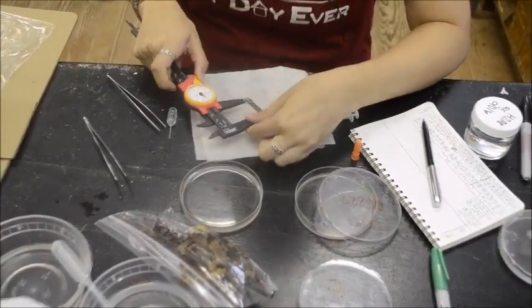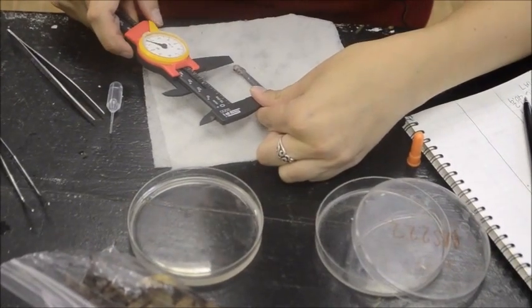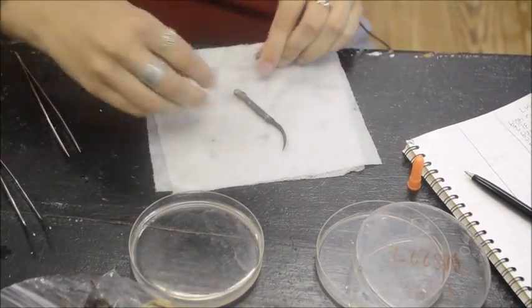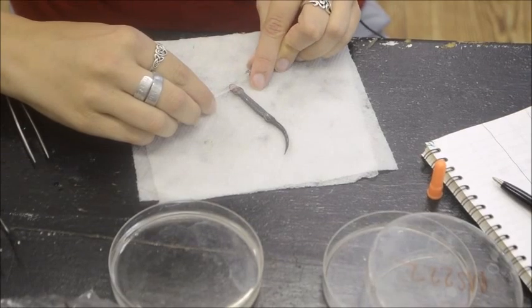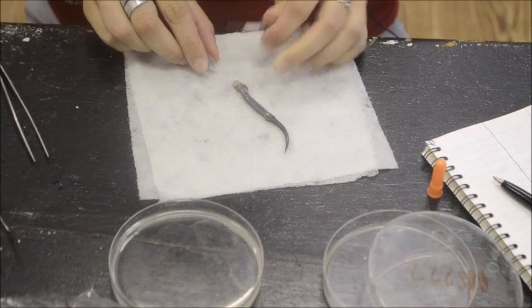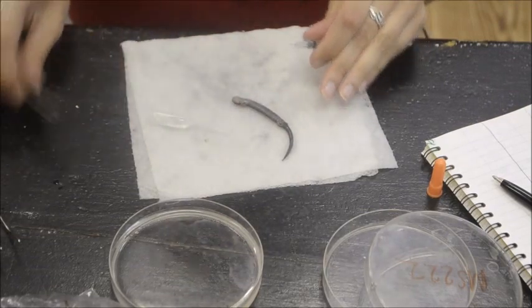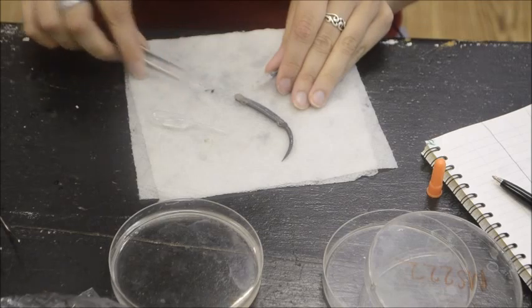Measure the SVL. And for the gastric lavage, you brace their bottom part of the jaw so you can easily slip in the needle to open up their jaw. Make sure you go underneath the tongue into their esophagus. And there it is.